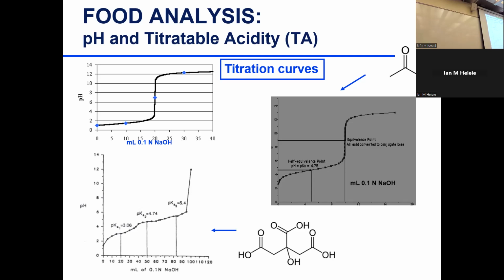We start seeing the pH increase, and then it kind of slows down. It resists change when the pH equals the pKa. So we see some flattening here a little bit. And then when we pass it, it continues to increase, it spikes, neutralization, equivalence point, and you get the milliliters needed to reach the equivalence.